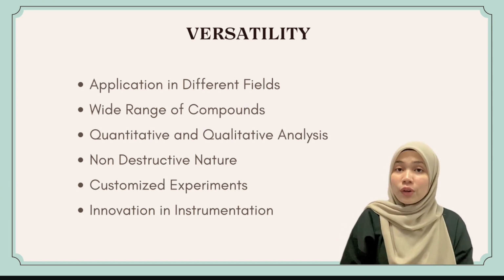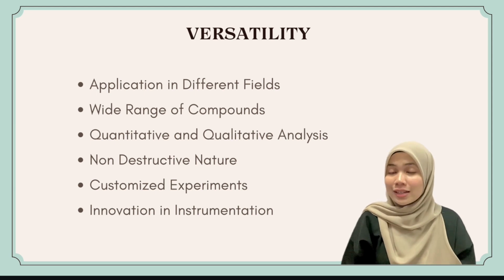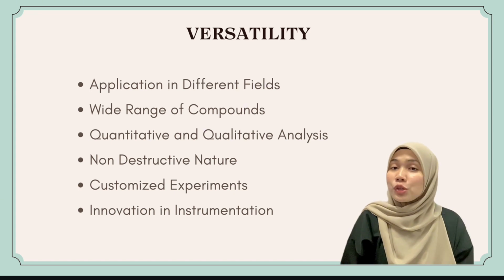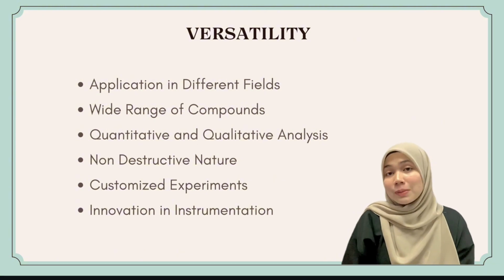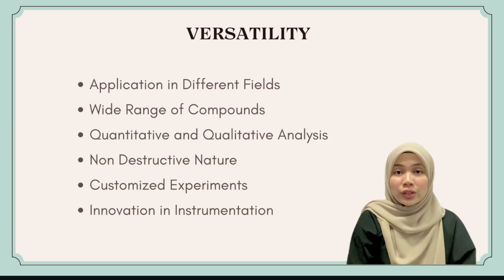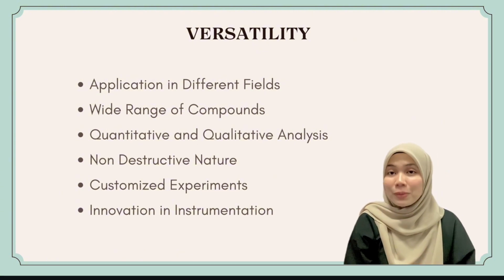Its dual capacity for quantitative concentration determination and qualitative structure identification fosters comprehensive analysis. The non-destructive nature of NMR permits repeated measurements, which is very suitable for varied experimental setups. Customizable experiments employing different pulse sequences cater to specific research goals. Ongoing innovation in NMR instrumentation, including hardware and software advancements, continually broadens its capabilities and applications.